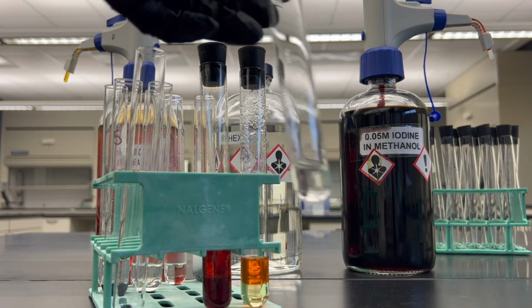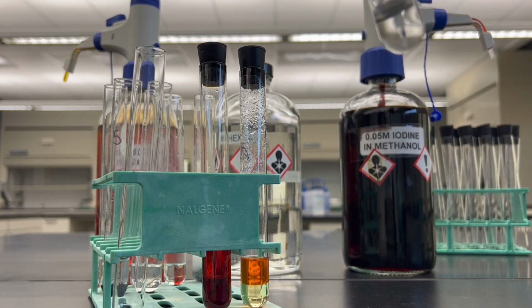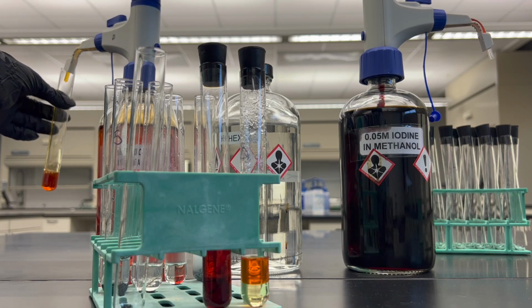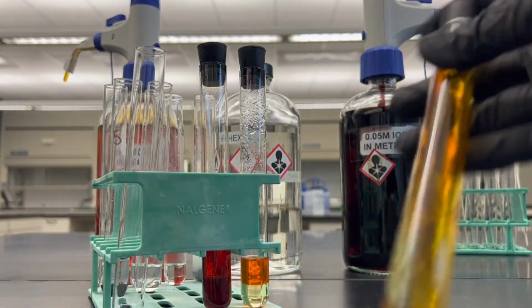Next up, I have some sodium iodide, so iodine ion, and I'm going to mix it with a little bit of bromine water. Cap it and shake it vigorously.